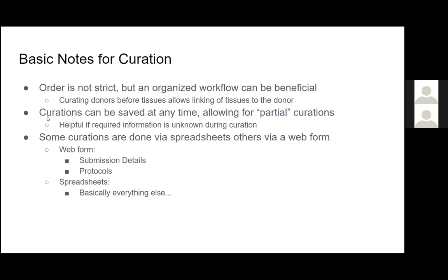Another thing is curations can be saved at any time, and this allows for partial curations. So as you're going through and filling out the information, if there's some required information that you don't know, or you don't have all of your donors for your submission readily available, you can go ahead and curate the information that you do have. You can always come back later and curate any missing data.